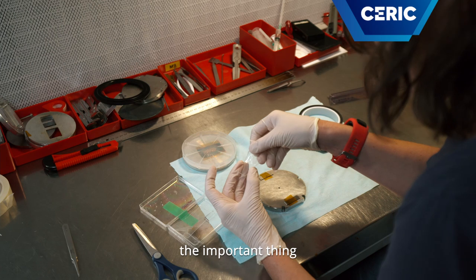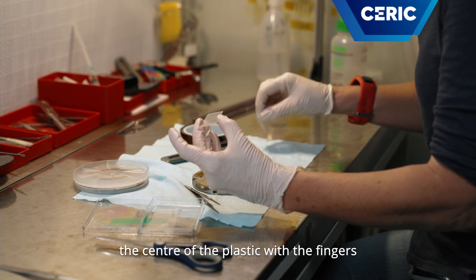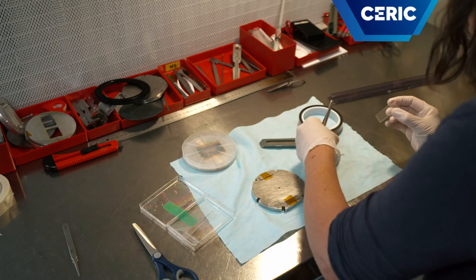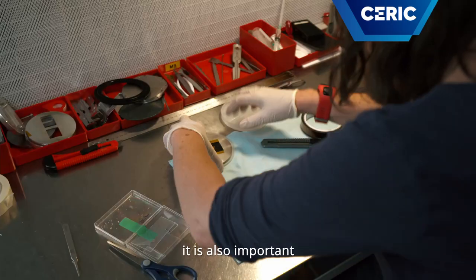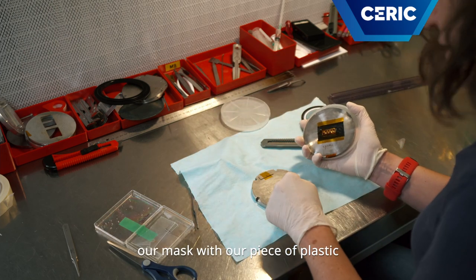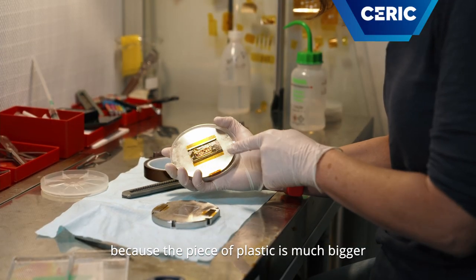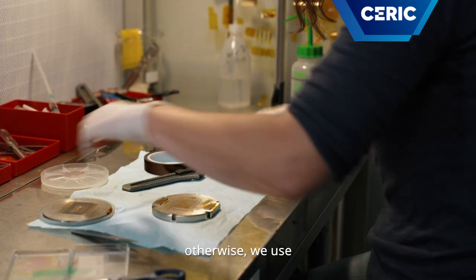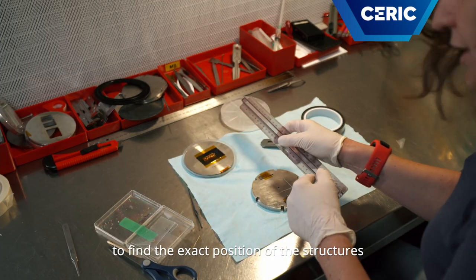The important thing is never to touch the center of the plastic with the fingers, and always use gloves. It is also important to align our mask with our piece of plastic. In this case, it's very easy because the piece of plastic is much bigger than the area that we have to irradiate. Otherwise, we use a ruler to find the exact position of the structures.